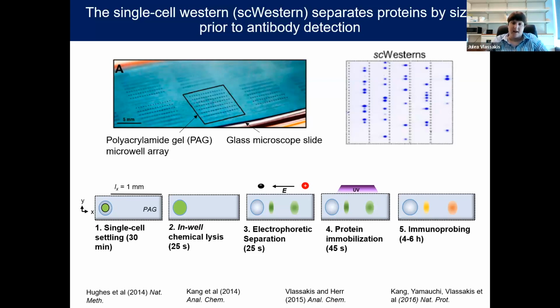But that's kind of the basis of this sort of assay. Now, I mentioned versions of the assay in which you might want to measure protein complexes in particular. So in those types of assays, the actual chemical lysis process is altered, essentially to use complex stabilizing lysis buffers that are used in centrifugation assays for pelleting F-actin complexes.